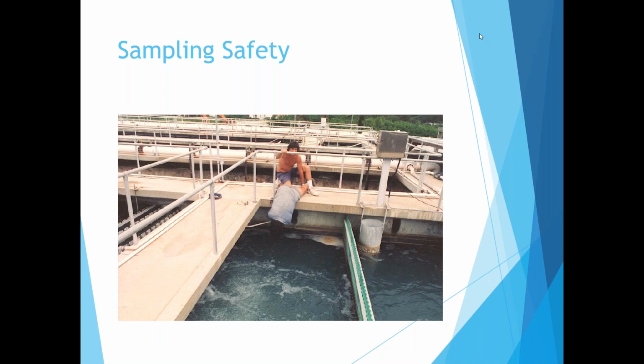So that's another reason that as soon as you open the door, the first thing you want to do is check the temperature. Now, if you have a portable sampler and it's on ice, like I mentioned earlier, the exact temperature isn't as much a concern. What we're looking at is, is there ice present? Is the water cold, or is it warm, or is it hot? We want to know that it's in the process of being cooled, because we understand that a sample that was just deposited is not at 6 degrees C. It's at the temperature from the body of water where it came from.